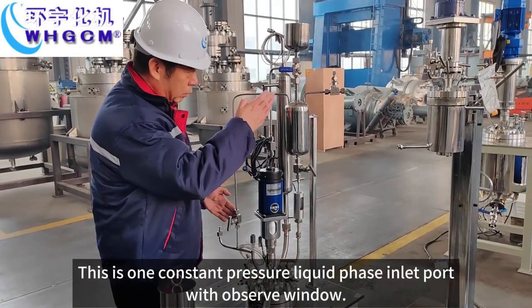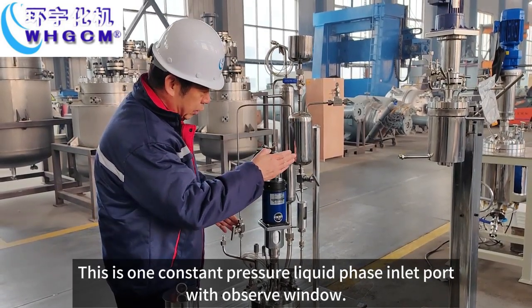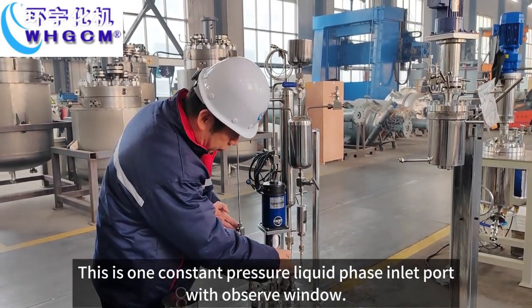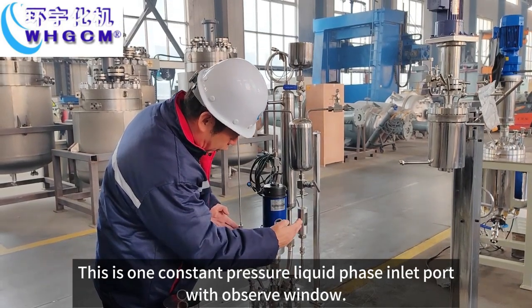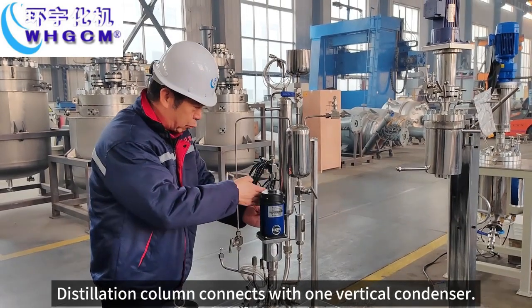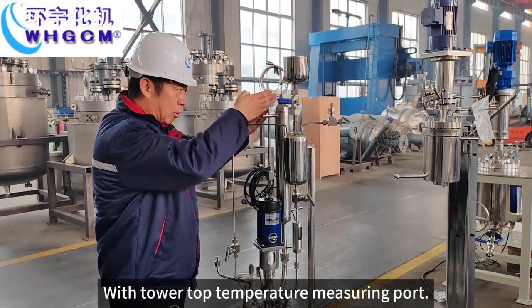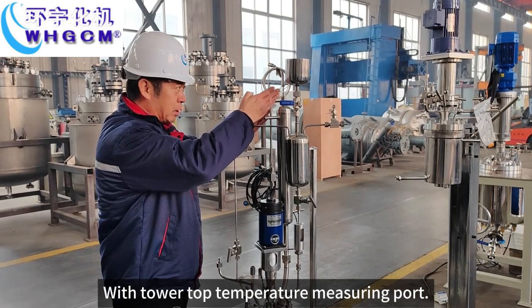This is one constant pressure liquid phase inlet port with observe window. Distillation column connects with one vertical condenser, with tower top temperature measuring port.